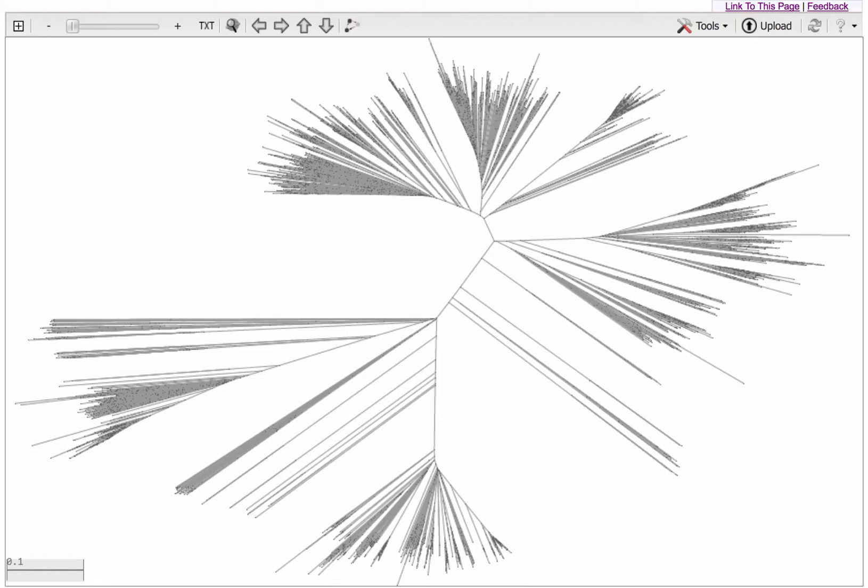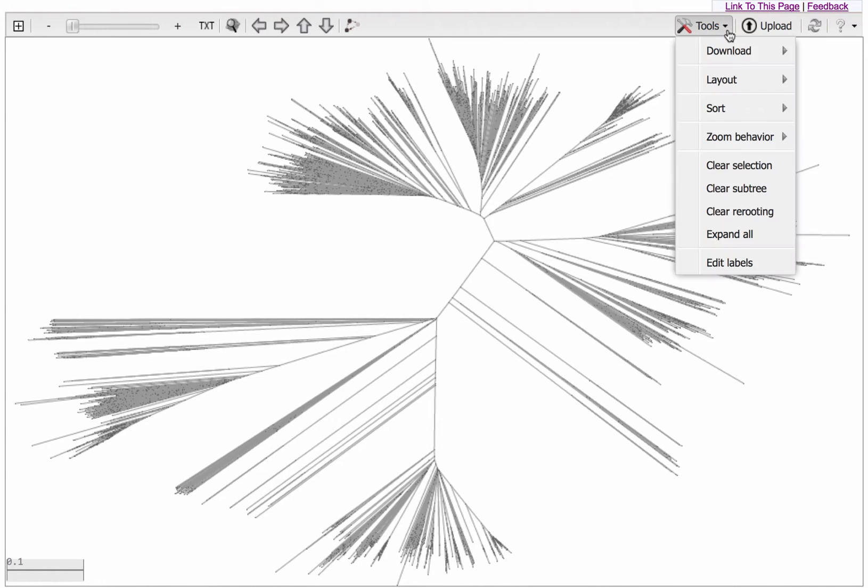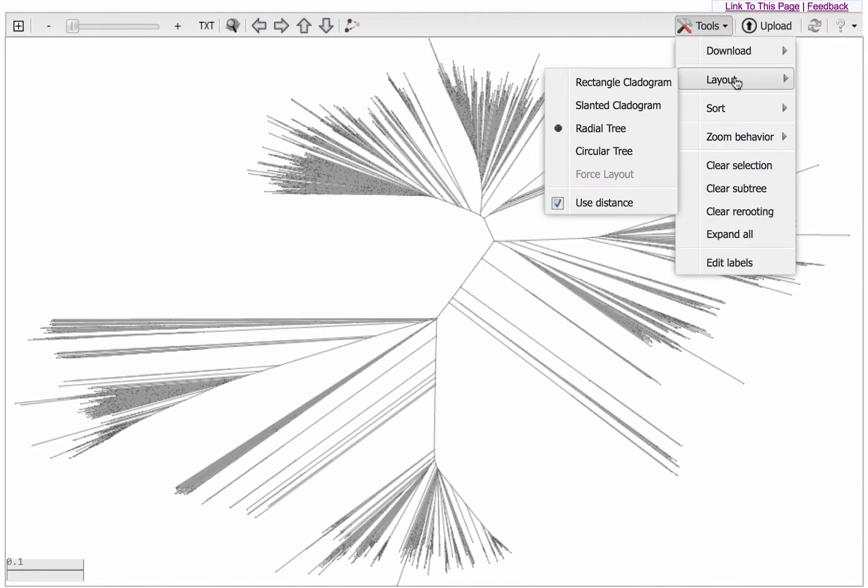This is the radial display of the tree. I'll change to Rectangular by going to the Tools menu, Layout, and selecting Rectangle Cladogram.